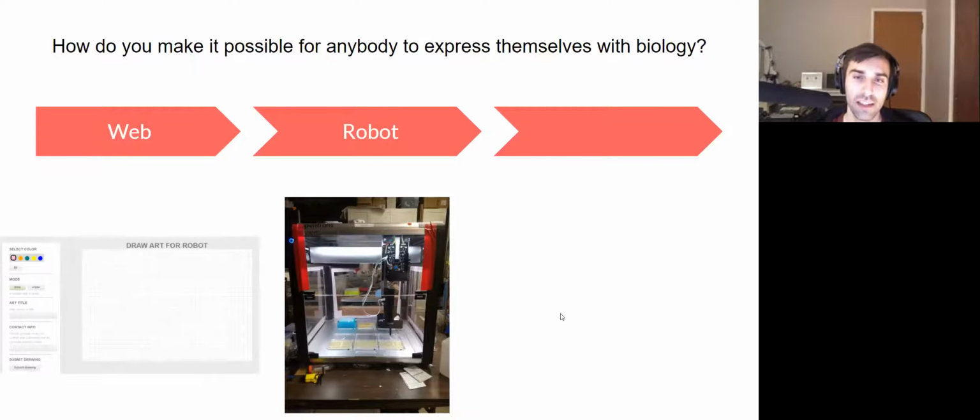And then this is just a short video showing the actual work that we've been doing. It's a lot of growing cultures, growing mediums and moving around, which is actually really perfect for getting hands-on in biology. I think the secret to all this is that a lot of us in the project are learning at least one of these skills as we go. So this has been really great for figuring out how to do basic stuff in a biolab, like grow cultures and then passage cultures, keep them alive, and then do sterile technique and stuff like we're seeing here. So here we're just loading each color, you can see they're labeled there, into a plate, which will eventually go on the robot. And so it's like preparing a palette.